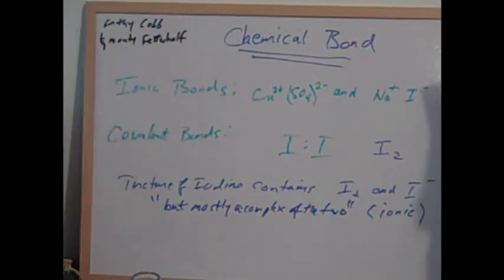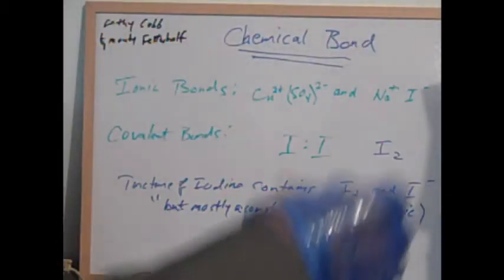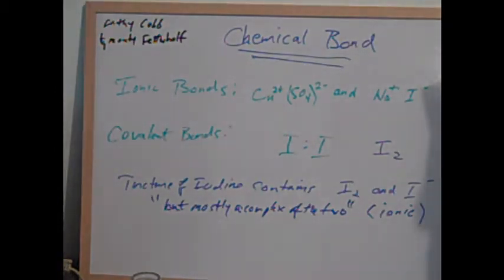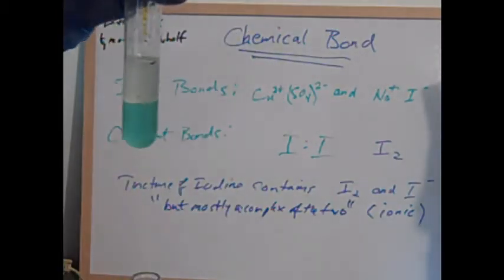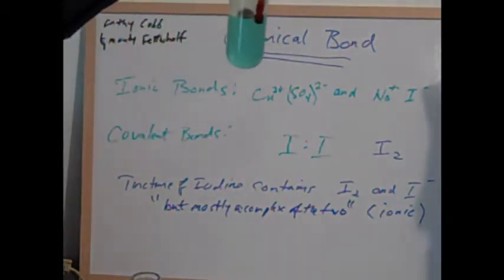Now what we're going to do, and this is the important part of the demonstration, the second part I think complicates what we're trying to learn here. This is the applicator for the iodine solution. We'll just rest it on the table. We'll add a few drops of iodine solution. I'll hold it so you can see that. I added a few drops.